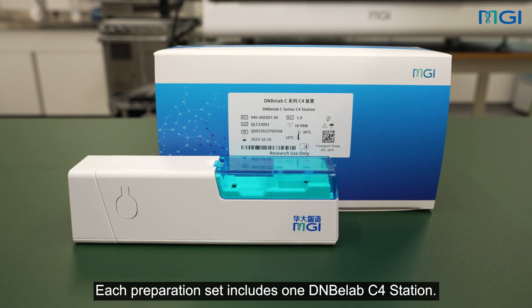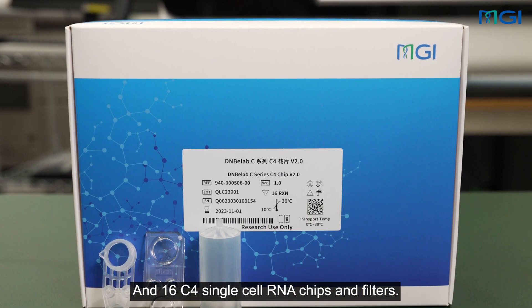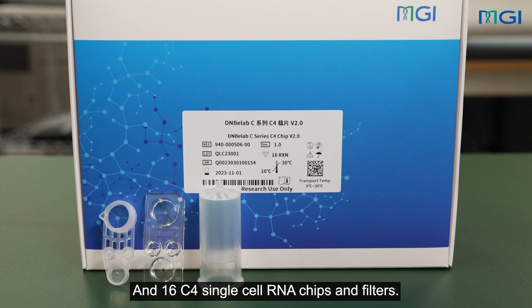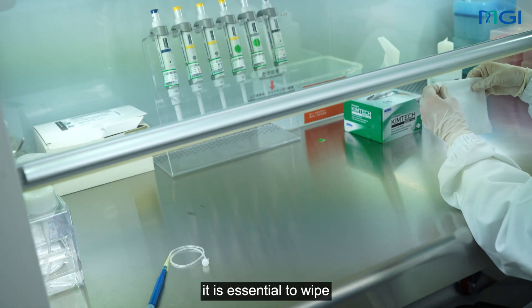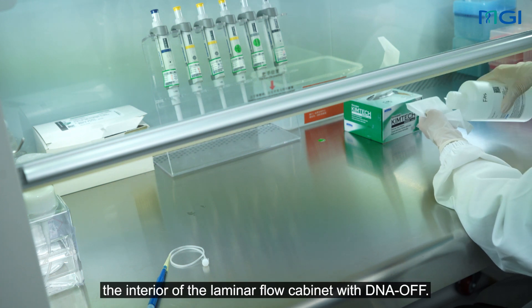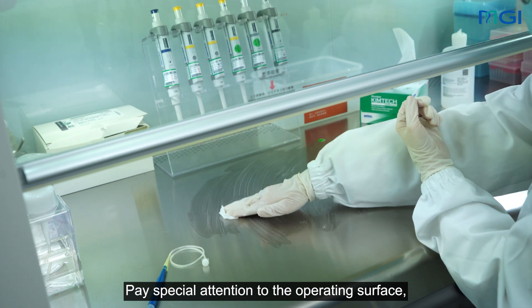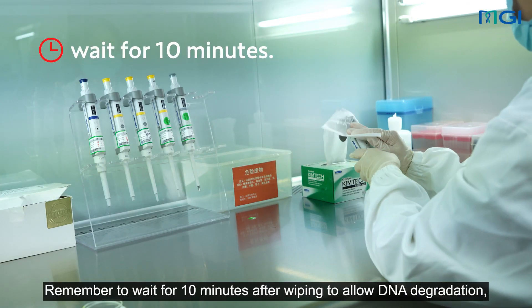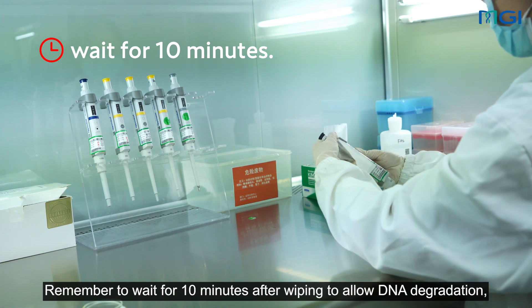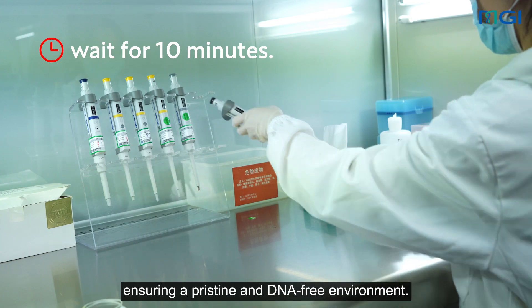Each preparation set includes one DNBLAB C4 station, and 16 C4 single-cell RNA chips and filters. Before commencing the experiment, it is essential to wipe the interior of the laminar flow cabinet with DNA off. Pay special attention to the operating surface, as well as any metal and plastic objects. Remember to wait for 10 minutes after wiping to allow DNA degradation, ensuring a pristine and DNA-free environment.